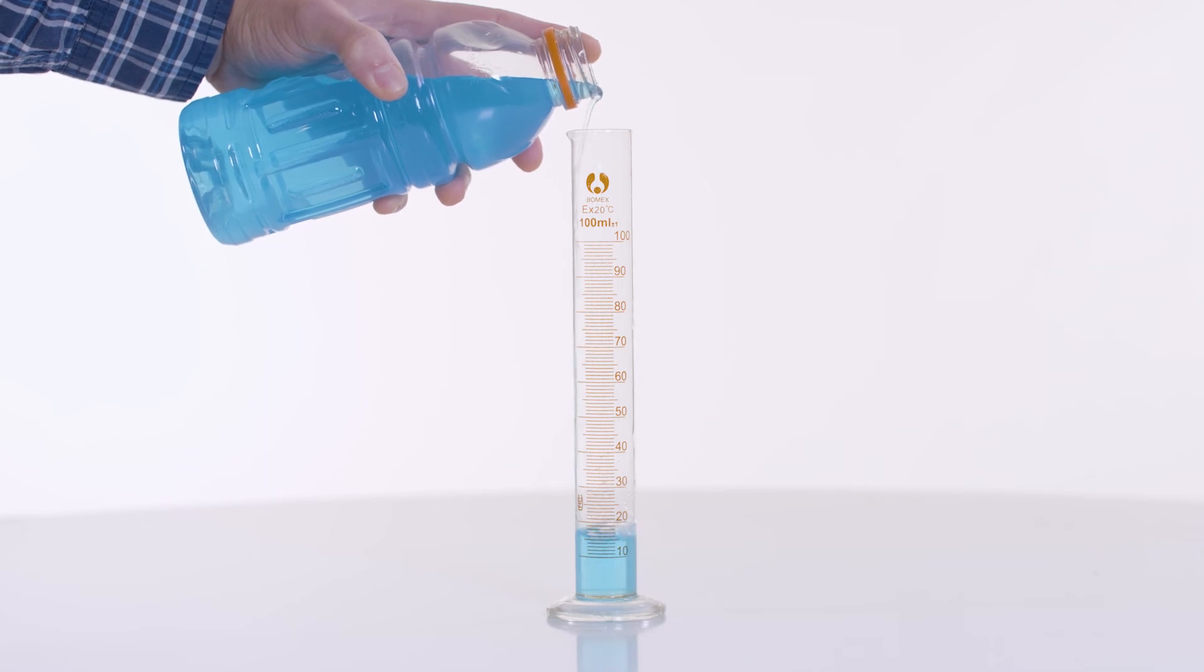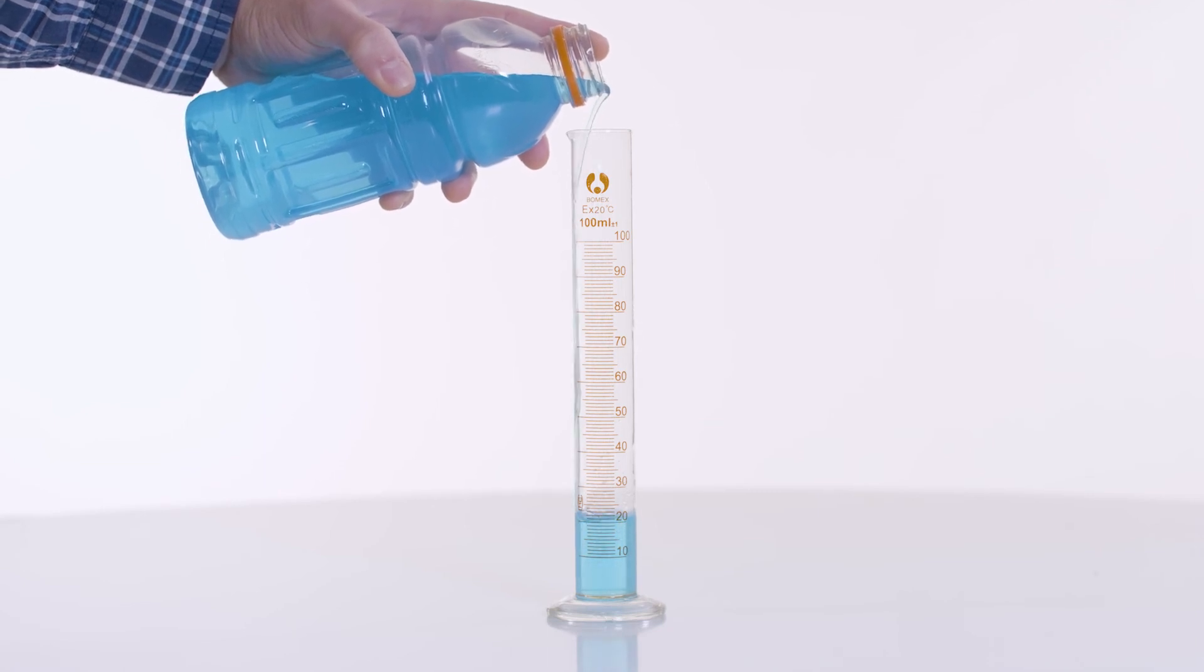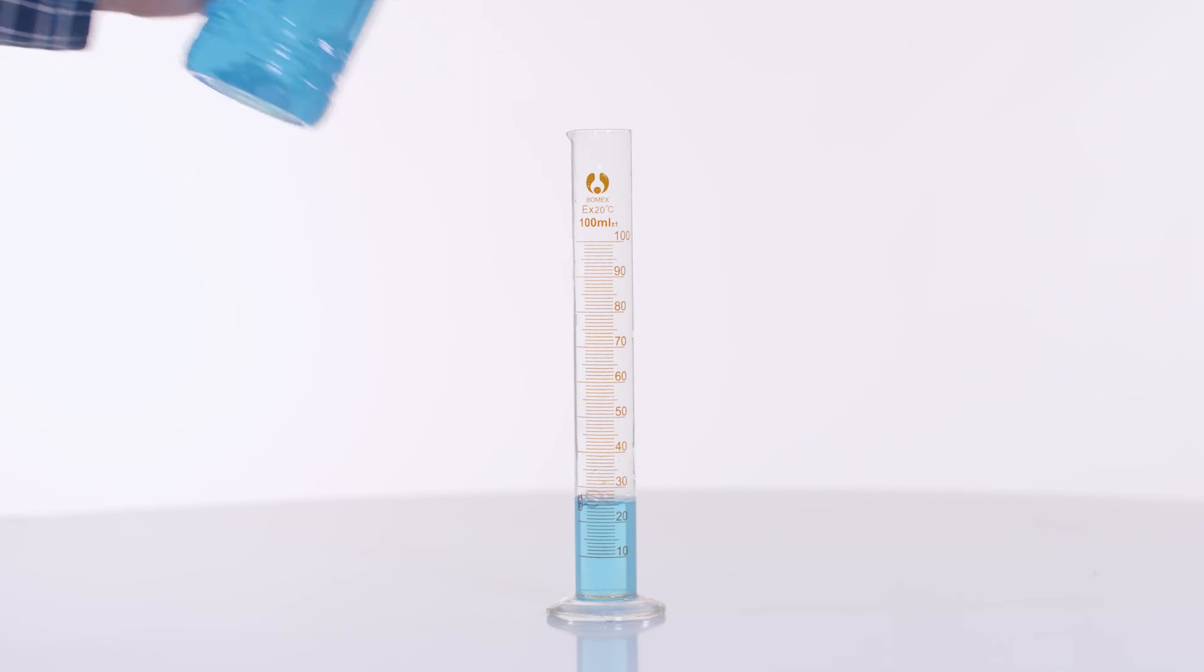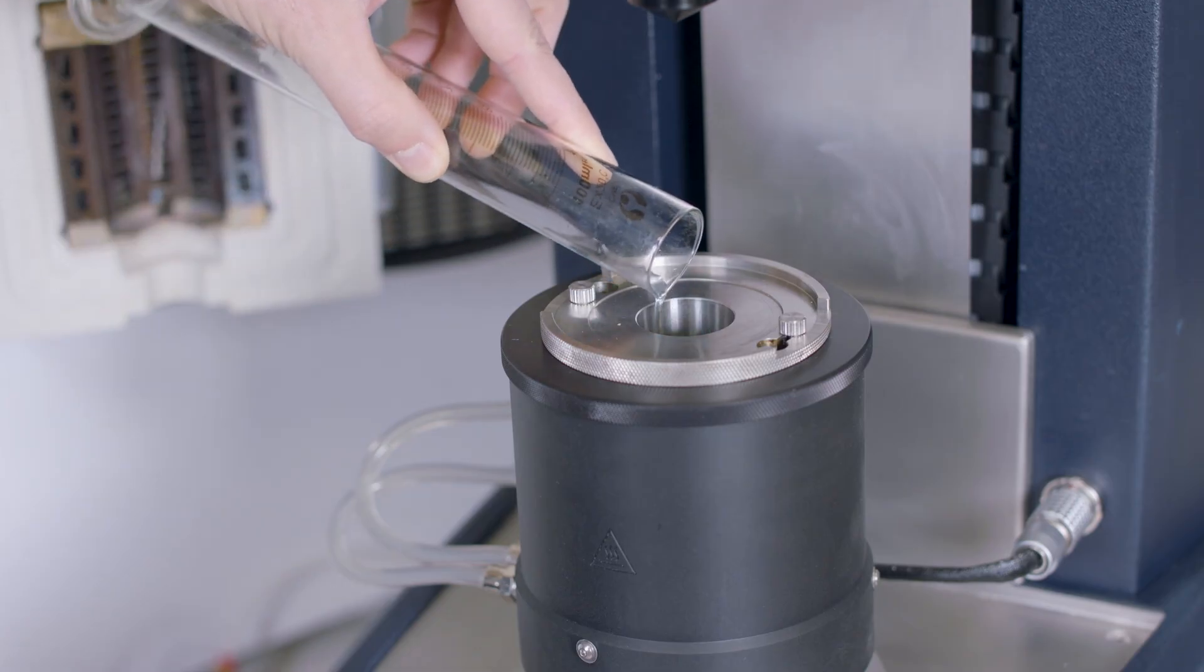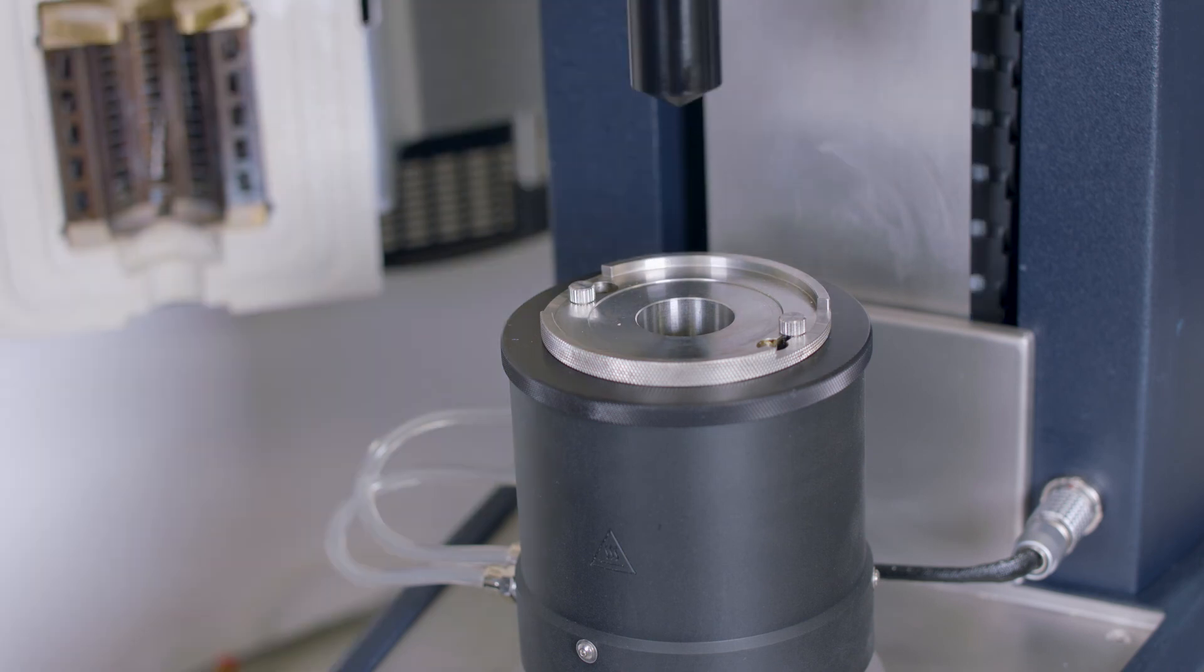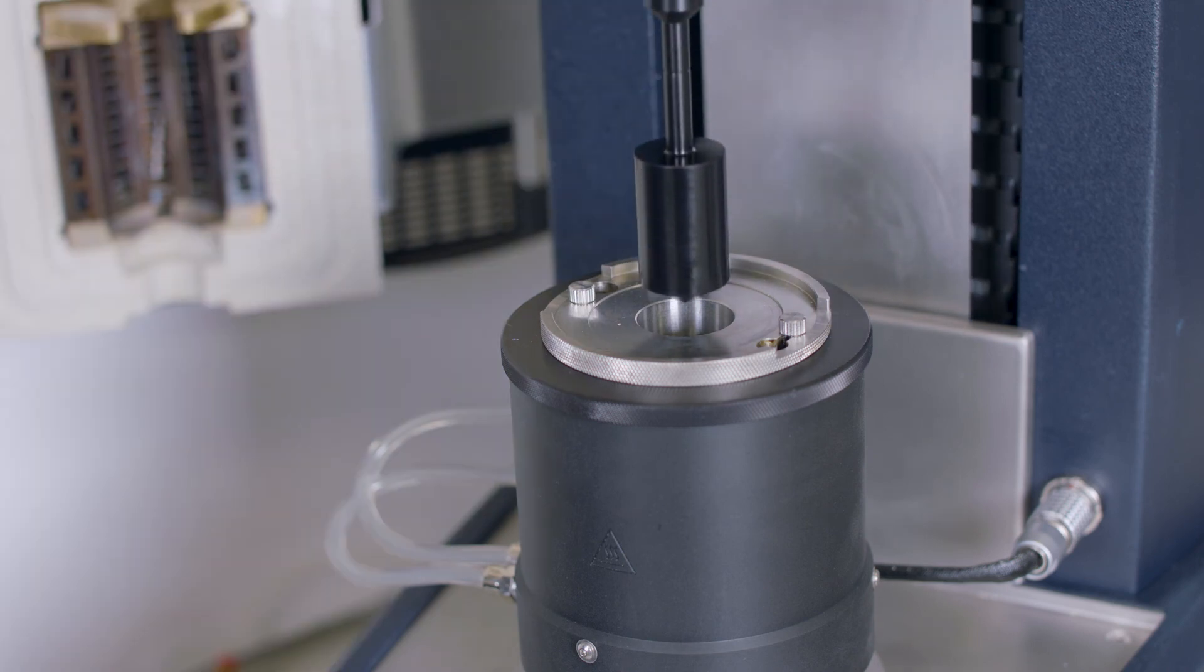To proceed with filling, measure out the desired amount of liquid into a graduated cylinder or pipette. With the upper fixture still at the top, proceed to pour this into the cylindrical cup. Then the gap can be lowered to the operating gap.